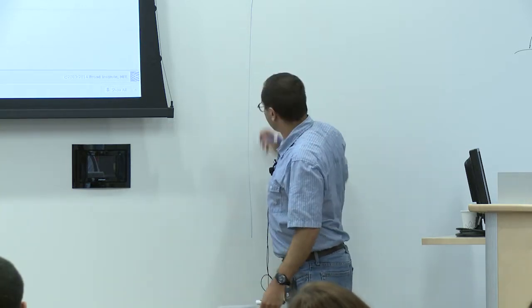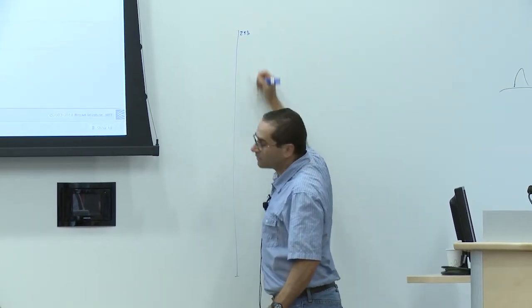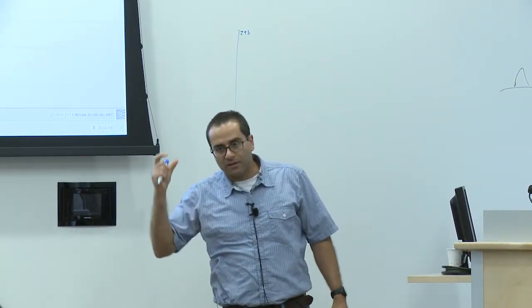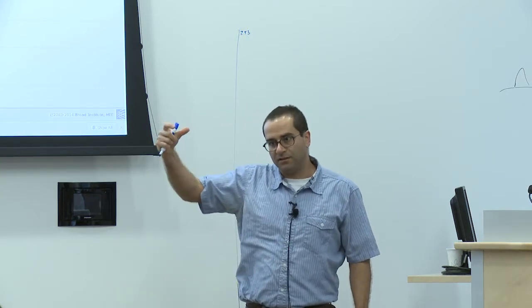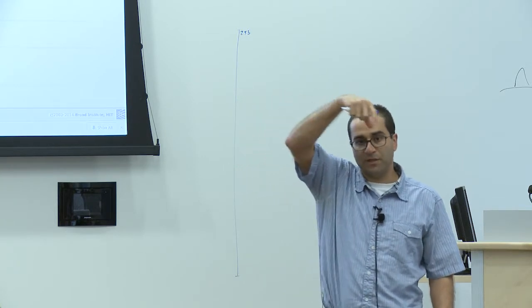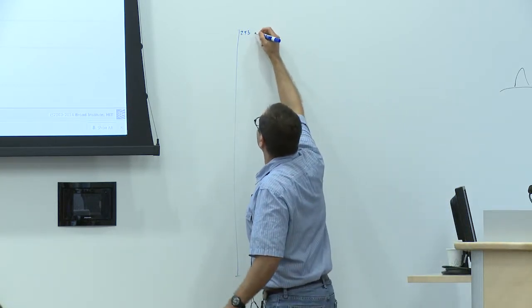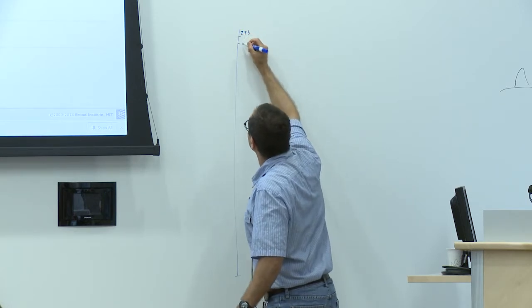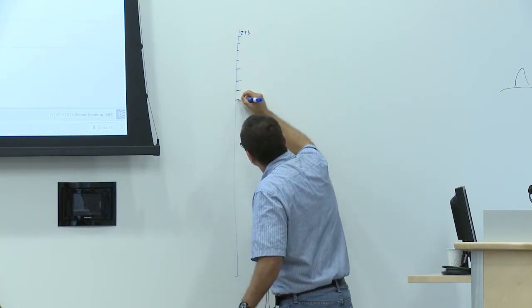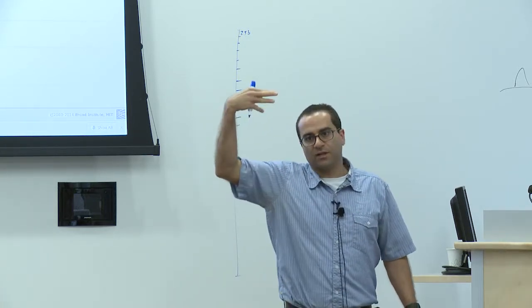But it goes all over the chromosome and breaks it into 25 base pair bins. And then it takes all the reads that we have in the BAM file, and the BAM file tells you for each read where it is located on the genome. So it takes all the reads and asks, for each of these 25 base pair bins, how many reads were touching it?